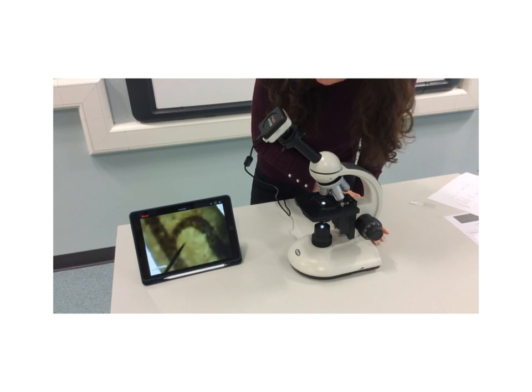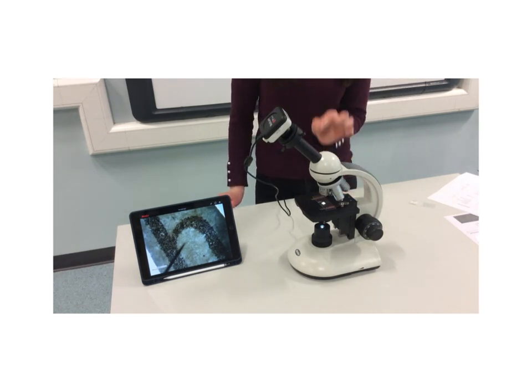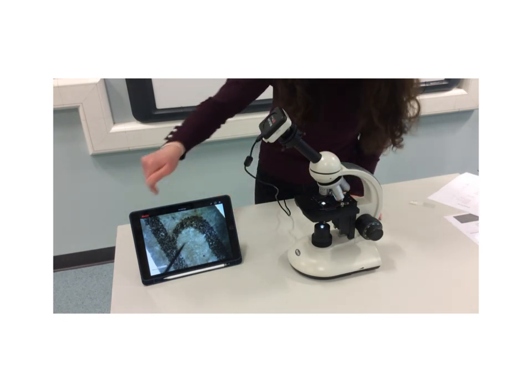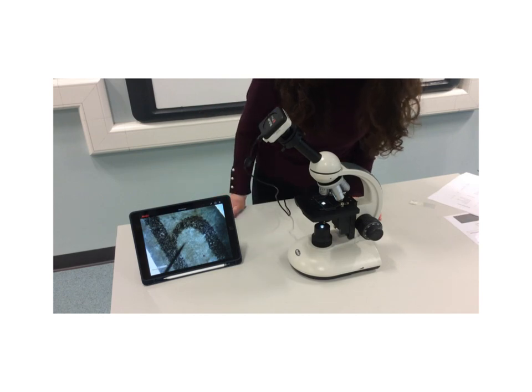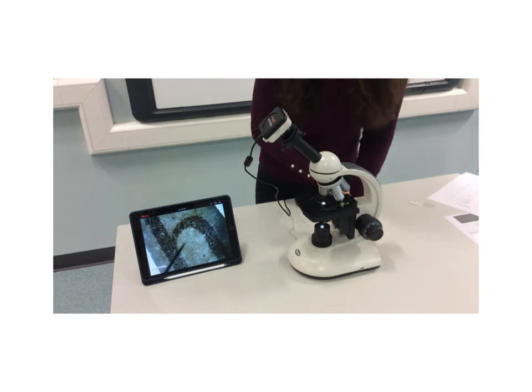And this is back to what we did just before Christmas. I'm just turning the focusing knob, the coarse one, until I can see an image. So if you remember, just before Christmas, we had a look at how we could take a tiny, tiny letter from a newspaper clipping and see if we could work out what letter it was from the microscope. So hopefully you can see the main shape of it here. This is the letter H from a tiny letter from a newspaper clipping.